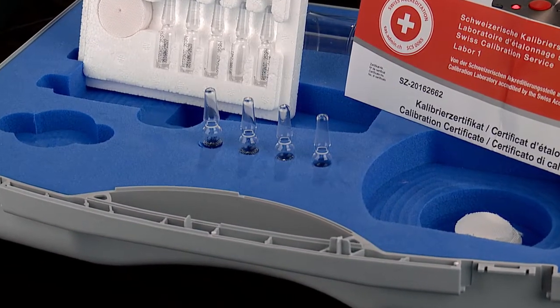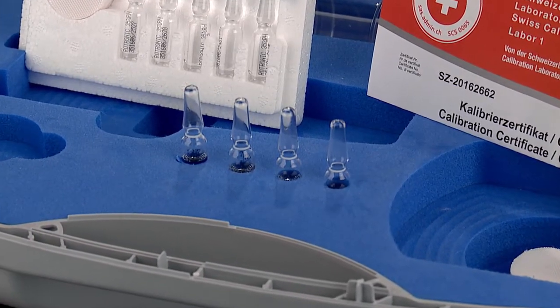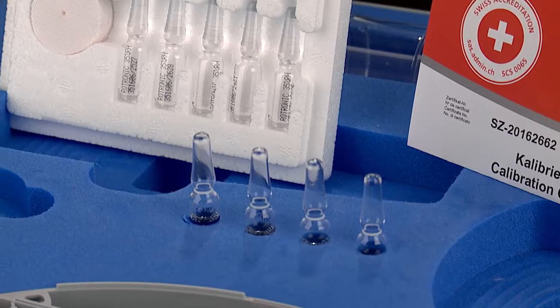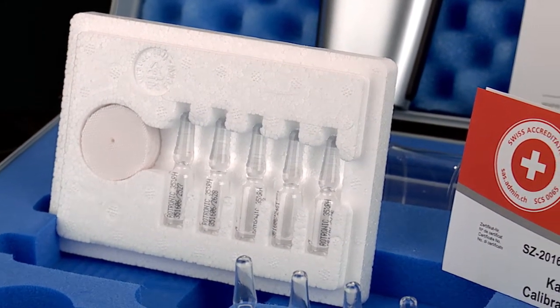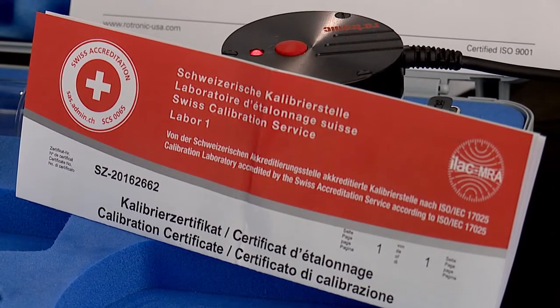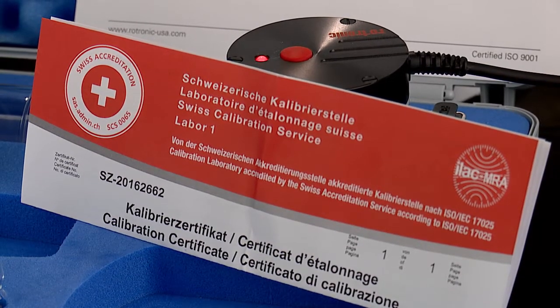All Rotronix AW systems come with calibration solutions which are presented in single-use glass vials. Each pack of five vials comes with a calibration certificate detailing the important variables of the calibration solutions. Standard calibration points for the Rotronix AW probe are 0, 10, 35, 80, and 95% RH.